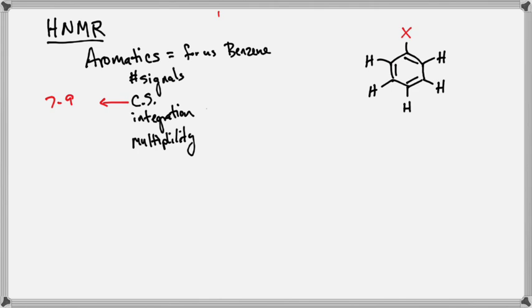This is where I said we're going to shift our balance around a little bit. Once we saw that we have an aromatic ring, we get excited and we start to skip some of those steps. So, oh, I saw 5. What does that mean? I have an aromatic ring and there's one thing on it. Not only did I solve an incredibly large piece, but I now know where the rest of my signals have to be attached. That's a huge piece of information, and that's very swiftly just looking at the total integrations in that 7 to 9 range.